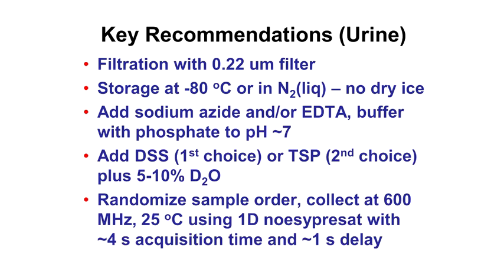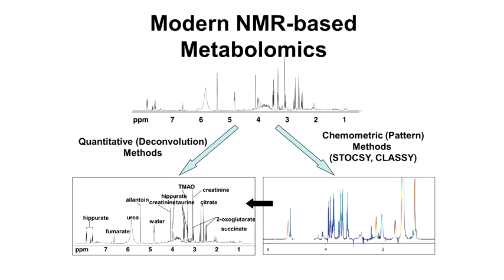So in this regard, even Jeremy Nicholson has gone from this to this, because they realized that there's no point if you don't have to do this. In those days, it was a matter of then once you found that the yellow-orange peaks were changed, what are they? And that becomes really difficult to figure that out. I'll talk about both techniques in detail in, I think, third and fourth lectures of today.